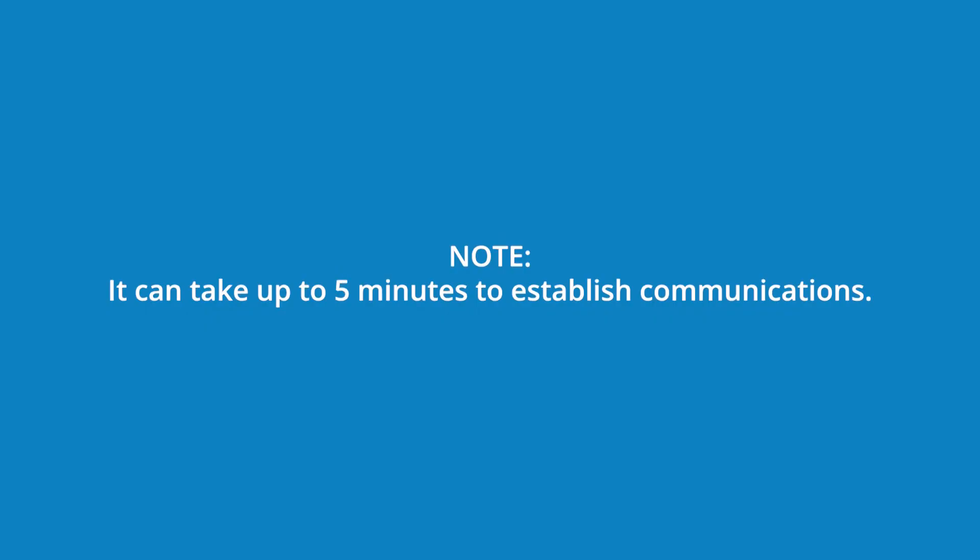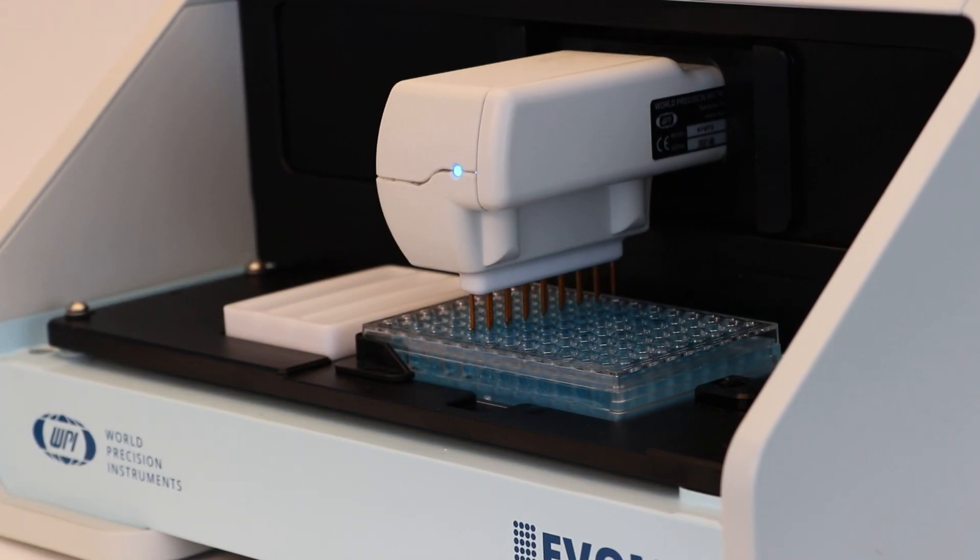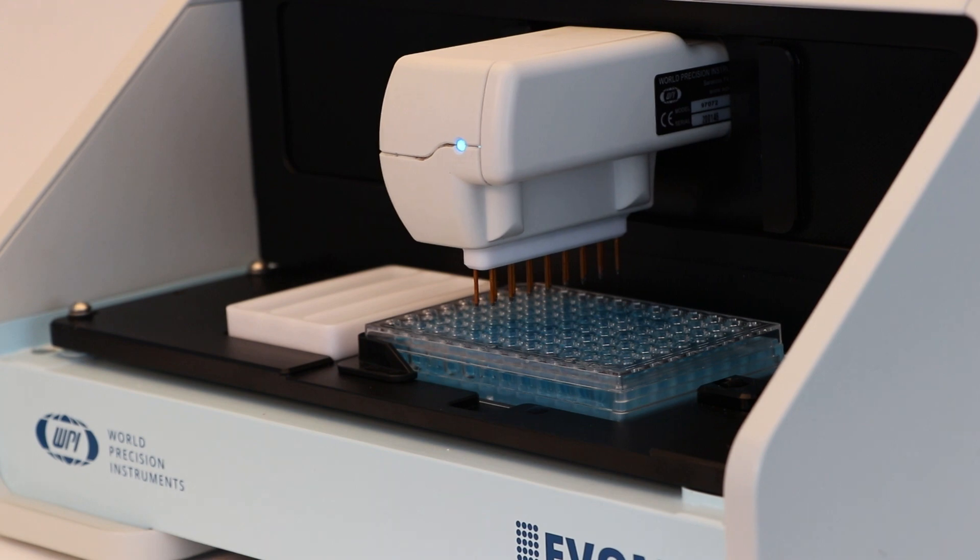It can take up to 5 minutes to establish communications. Now the system is ready to analyze the Corning 24 HTS plate.